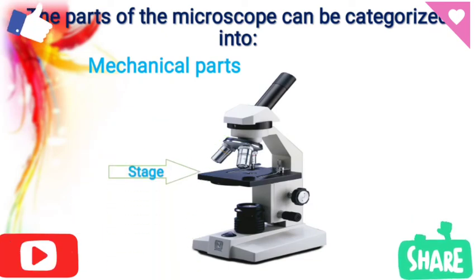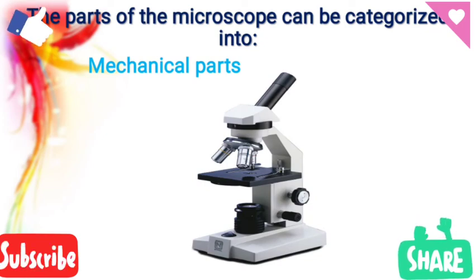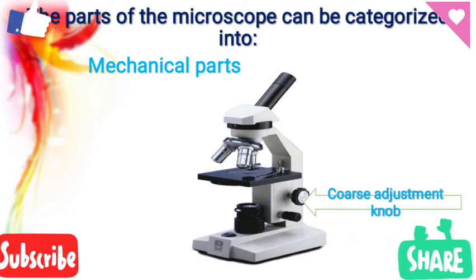Then the stage. Then the clips, where the slide is fixed firmly. Then the diaphragm, which adjusts the light source. Pillar, from base to arm, it supports the weight of the microscope. Then we have the coarse adjustment, the larger knob.